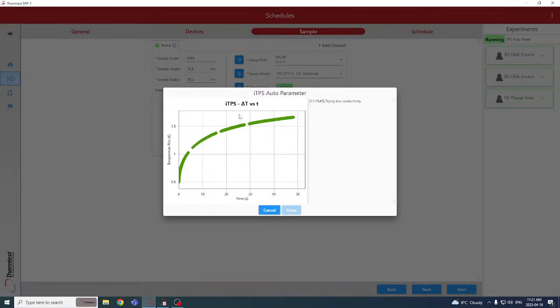We want to be really open about that this is not calibration. We're not correcting anything. We're providing the user the iterative approach that a manual approach would be. So we're doing that automatically with this intelligent software element. So we can watch this for a bit, and once it's done, we'll go to the next window with those parameters that it's asking us to use and schedule a measurement. Then we can review some data that I've previously measured on the same sample.